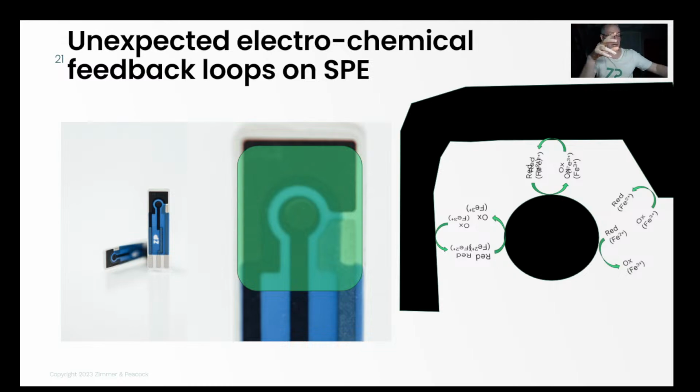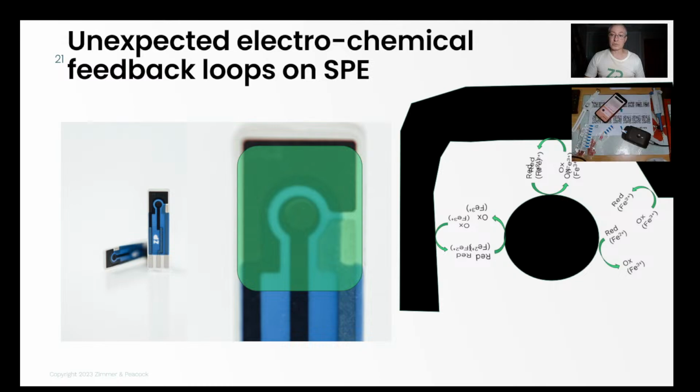So people, I think, sometimes in their research with screen printed electrodes probably don't realize it, but there are definitely scenarios where you're doing an accidental generator collector experiment, and probably the longer that experimental run is, let's say it was amperometry, the more likely you are to do this. If you did a quick cyclic voltammogram at like 100 millivolts per second, with a potential range of like plus or minus 500 millivolts, you probably won't have time to set up this. But if you're doing a longer amperometry experiment, then you probably will find that you'll actually get this feedback loop.